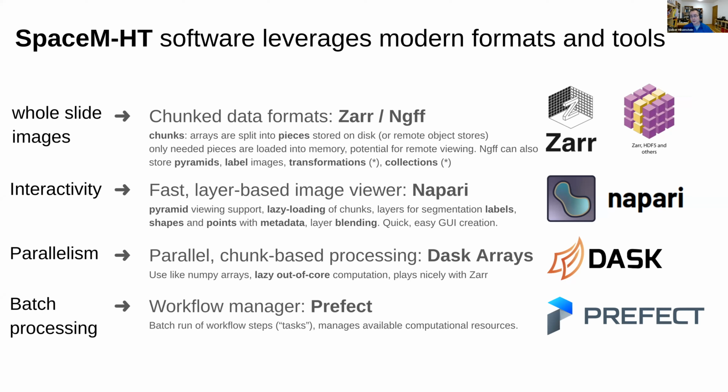Another thing that we do, if I go back to napari, one of the reasons we use it is that we have a few interactive steps that require user input. But we don't want to have user input for 40 wells. So the idea is to have the interactivity at the beginning. The user can inspect whether everything is right with the processing parameters they choose on some tiny sections. They can do a few clicks to do a coarse registration, and then we do the batch processing based on some config files that are generated, and that ensures that we can reproduce that same run with the same parameters based on the configuration files.